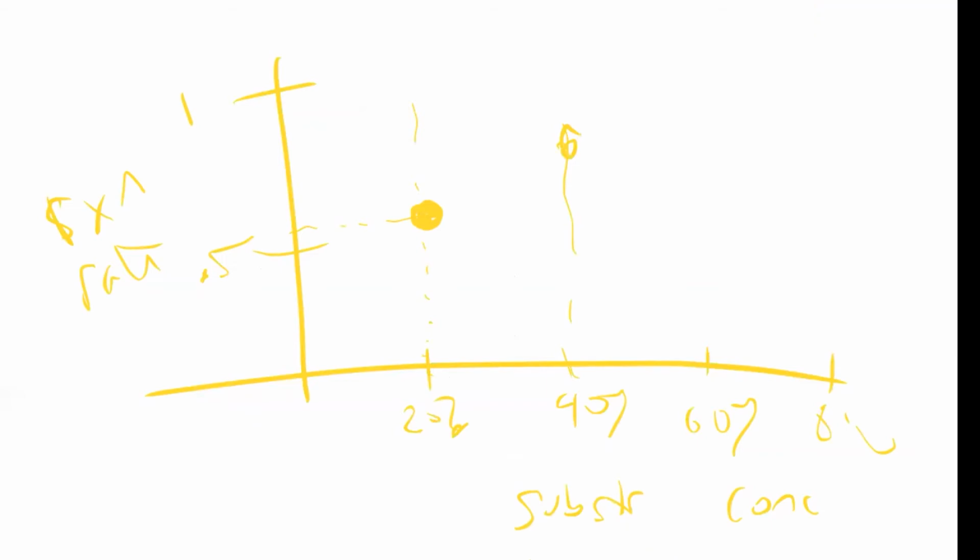Where are you getting the 20% for the trial 1? Isn't it like 1 milliliter? So wouldn't it be 10%? 1 mil out of how many? Out of a total of 5? Yeah. So that's 10, right? Oh no, that's 20, right? I don't know.